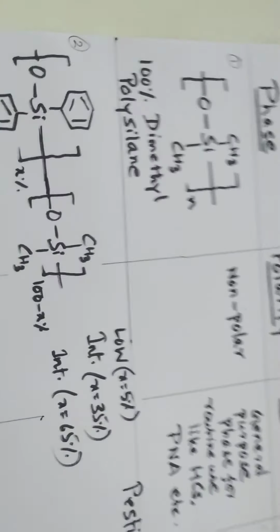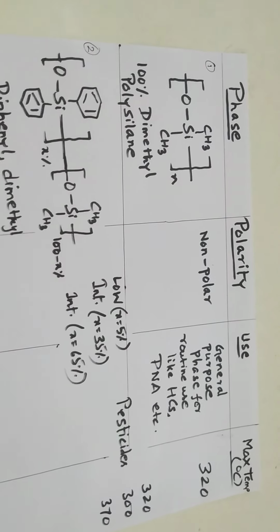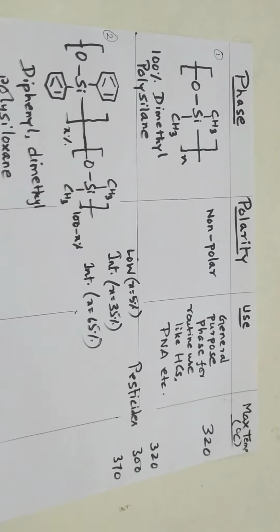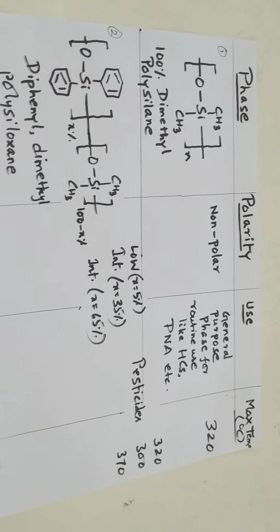Now I have prepared some phases of the stationary phases, the polarity of those stationary phases, their uses, and the maximum temperature that is used in the operation of such stationary phases.